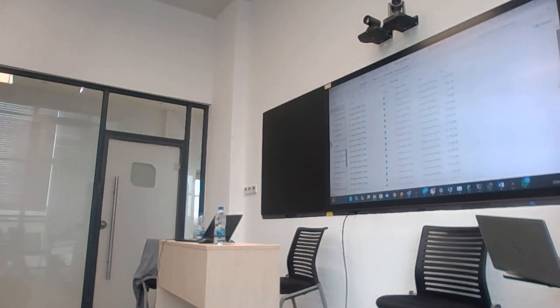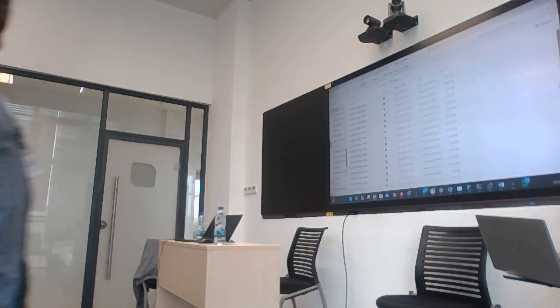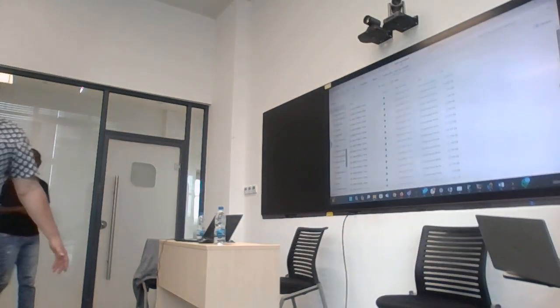When we're running the Epi2Me, we'll talk to you guys specifically because it's looking slightly different on your computers. We've all found this data, right? This is Mpox clade 2 data. I'm using clade 2 for the training because it was not easy to get clade 1 data. But you guys will be generating so much. Well, we hope not, but you probably will. In fact, if you're in Cameroon, you're probably going to be generating both clades. You guys are special like that.